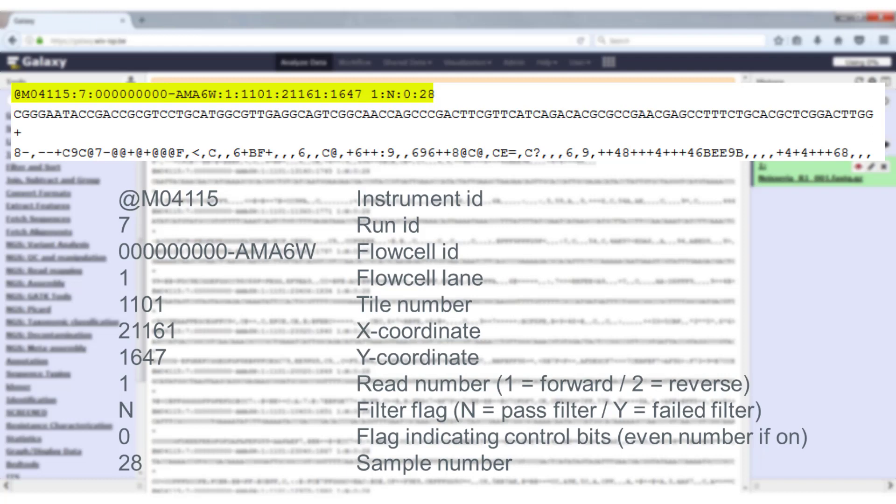So if you see a file where all the reads are forward reads, you always see a one, then you know that you either have a single-end experiment or that you only have one of the two files of a paired-end experiment. If you would see alternating forward and reverse reads, so one, two, one, two all the time, then you have an interleaved data file for a paired-end experiment.